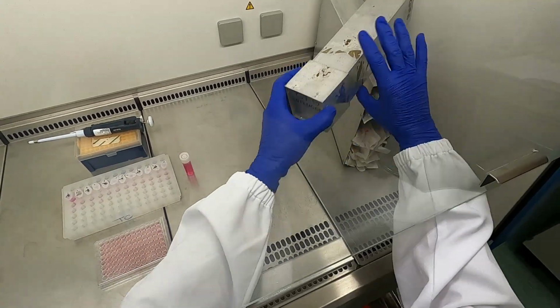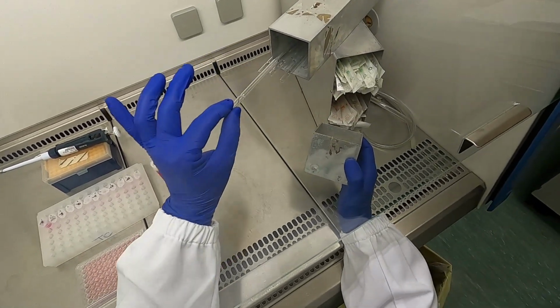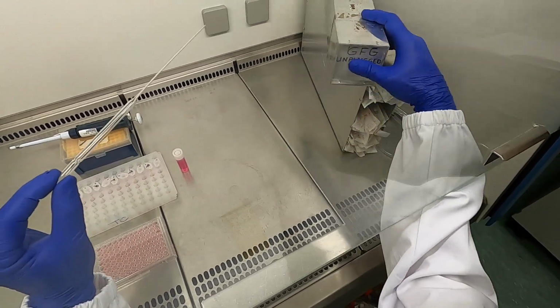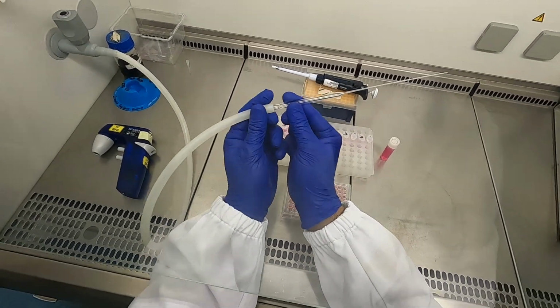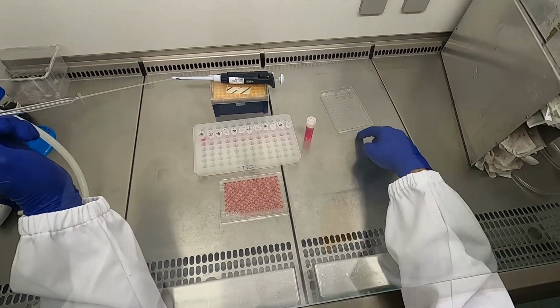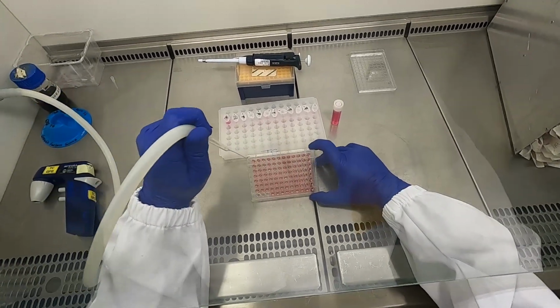Let's take a clean Pasteur pipette. This is glass, connected to the vacuum, and that will allow you to aspirate to remove the medium. So let's go for the top row.